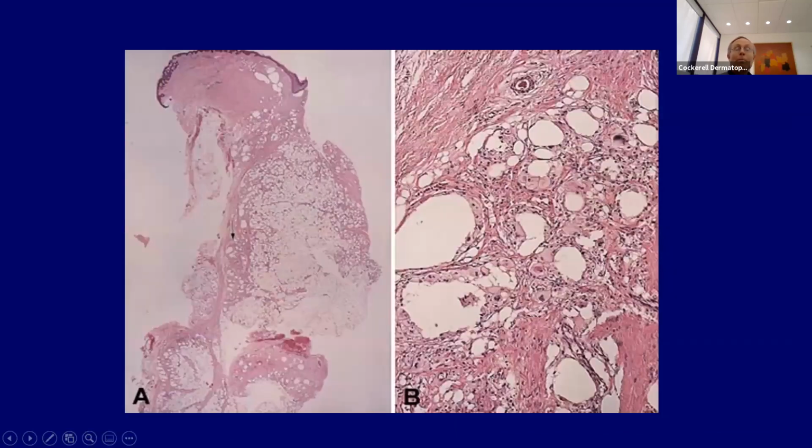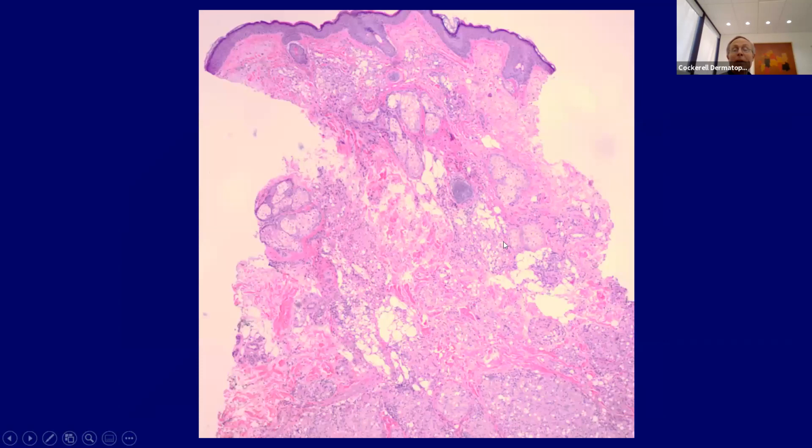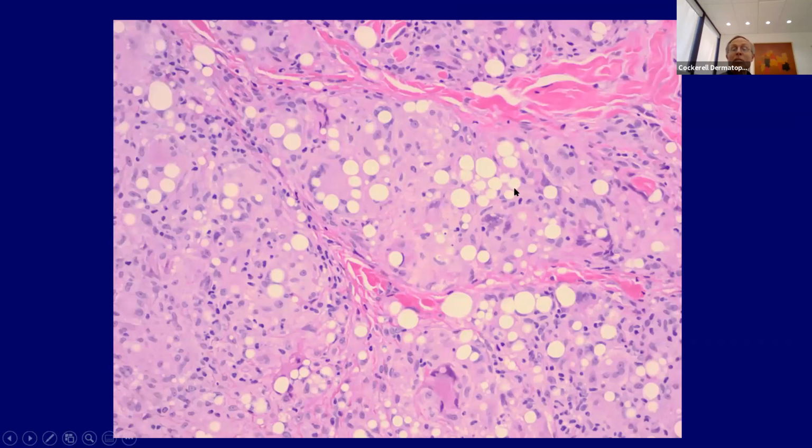And this is an example of a paraffinoma, injected silicone and other materials in the skin. It's a mostly lobular panniculitis with granulomatous inflammation. And if you look inside the histiocytes, you see these little vacuoles. Another example here, diffuse lobular granulomatous panniculitis. And all of these little tiny droplets are silicone droplets. So this is silicone granuloma in the skin, and this is pretty characteristic. So if you get small little tiny bubbles inside histiocytes that are relatively similar sized, think of silicone.